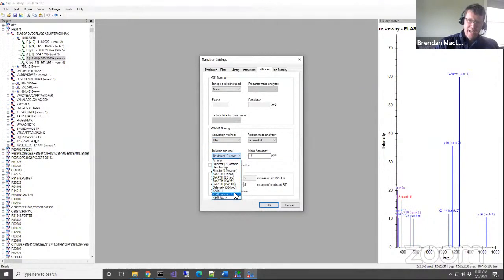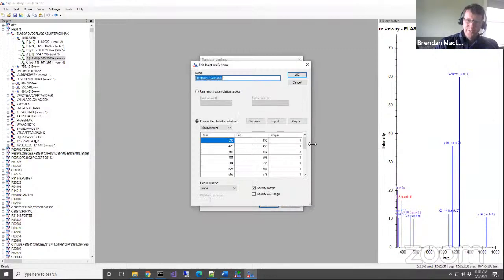But this gives you the ultimate flexibility here. I definitely don't want to say it's got to always be choosing an import. If you prefer not to specify this isolation scheme, I guess maybe that's the question. You're saying, why not just always use results?